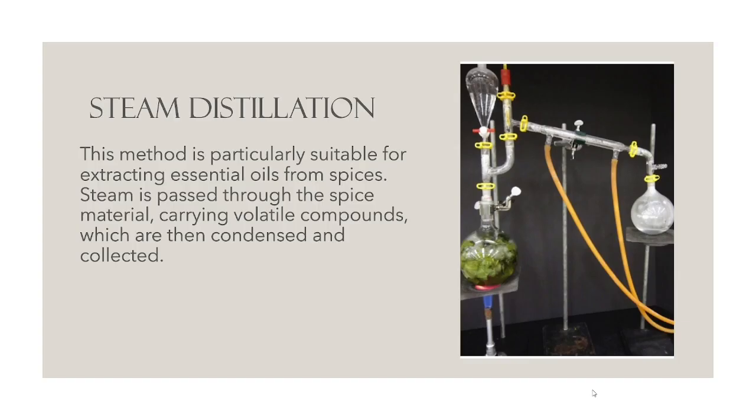The next method is steam distillation. Steam distillation is a method particularly suitable for extracting essential oil from spices. Steam is passed through the spice material carrying volatile compounds, which are then condensed and collected.